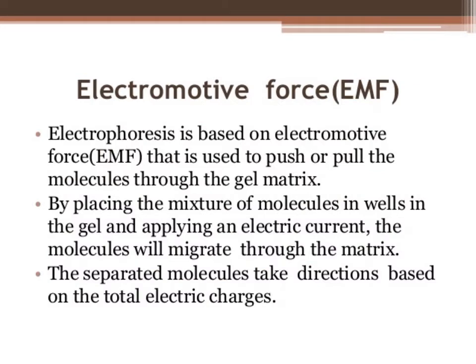Migration during electrophoresis is dependent upon the electromotive force. So when the molecules are placed in a gel matrix, they are going to migrate under the influence of the electric field, towards the oppositely charged terminal.